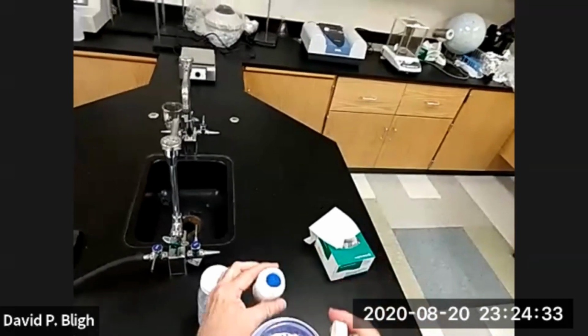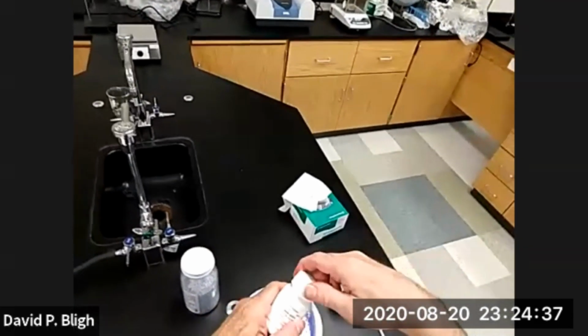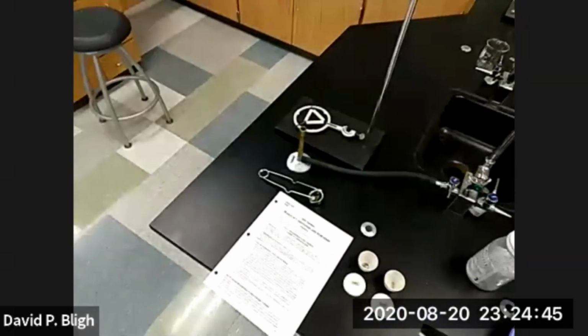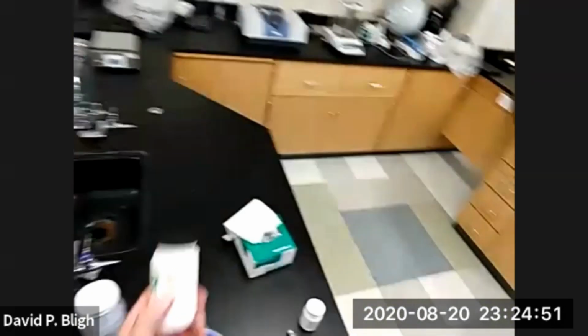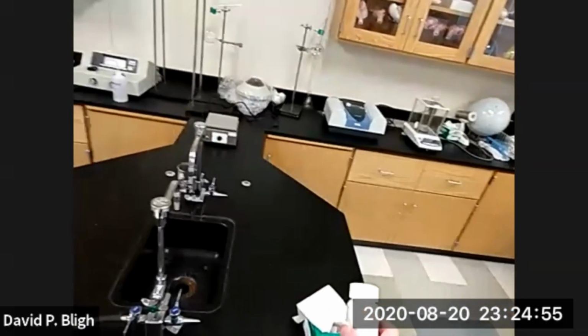And it's a blue color. Maybe you can see it. It gets blue like that when it has water in it. Okay. The other part, I'll show you while we're here, is the thermal decomposition of sodium hydrogen carbonate. Now, copper sulfate has water of hydration.